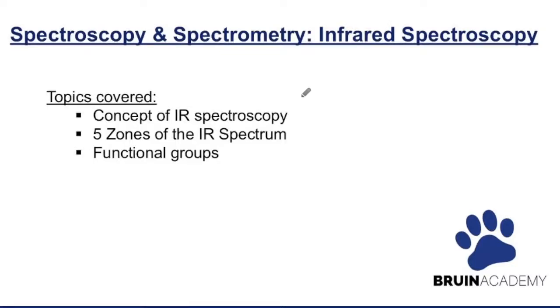Hey everyone, welcome to our video today on infrared spectroscopy, or IR spec. We'll be going over the concept of IR spectroscopy today, talking about the different zones of the IR spectrum and highlighting really what this spectroscopy process is about, which is understanding what functional groups compose the molecular structure of the molecule that we're looking at.